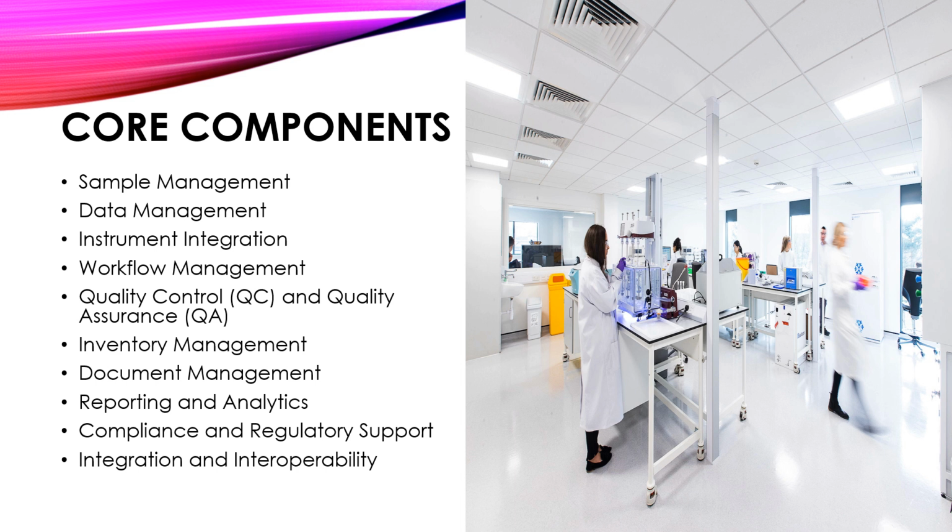Reporting and analytics. A laboratory management system generates customizable reports and provides analytical tools to analyze laboratory data, monitor performance metrics, identify trends, and make informed decisions to improve efficiency and quality.